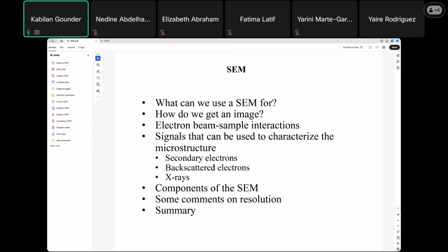So what is the scanning electron microscope? It's very, very important, because with a light microscope you cannot see some images, as they are very, very small, so it requires electron microscopy so that you can easily visualize the evidence. Even though there is a lot of processing, chemicals and time involved, once you get this, the information is very valuable. Then how do you take a picture, how you process it, these are another interesting topic.